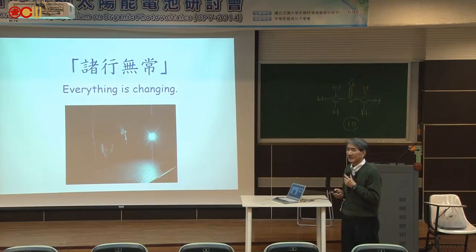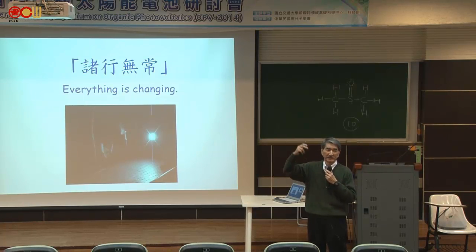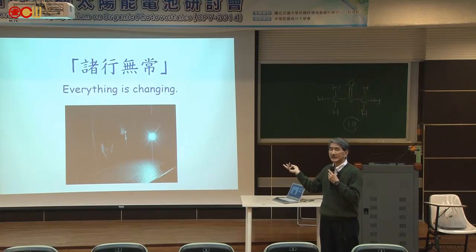So I think I stop here, saying that Raman can do many things, starting from the photochemical reaction in the excited state, the picosecond, femtosecond, and it can also study those very fast dynamics in the living cell. Hopefully we can elucidate more deeply what life is at the molecular level. But also Raman can be used for, say, food science or medicine or many practical applications.